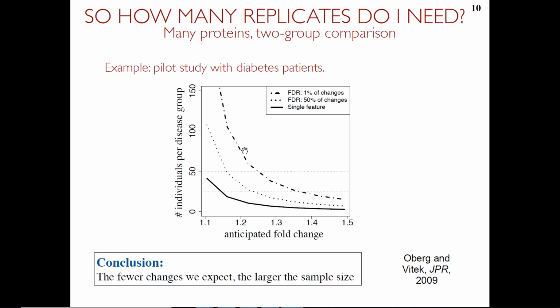Same thing for low abundant, right? I understand that, of course, this is where the value is, but if it's so close to the noise that it's not reliable, you may be better off just removing it based on the intensity. But now, if your experiment really wants to go for lower abundant proteins, don't make any mistakes, because you would need a sample size that matches the objective. It's not enough to say, yeah, but I want to have low abundant proteins. If that's your objective, you have to design the experiment for that objective, and this really means a much larger sample size.